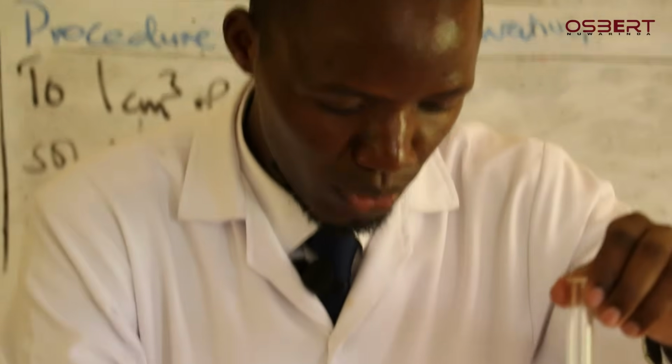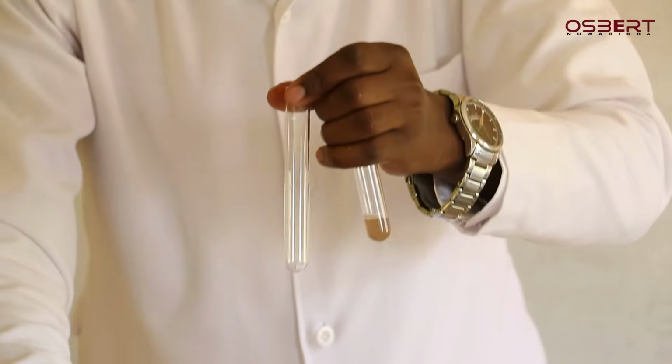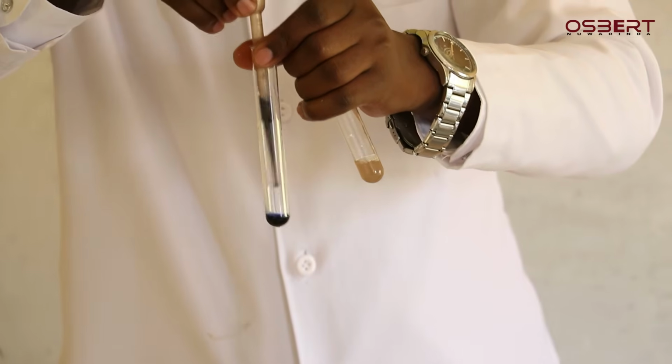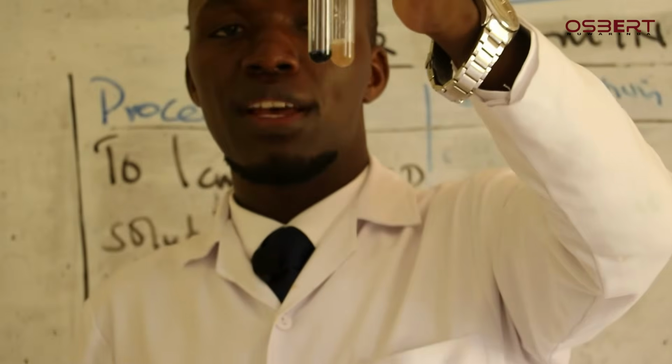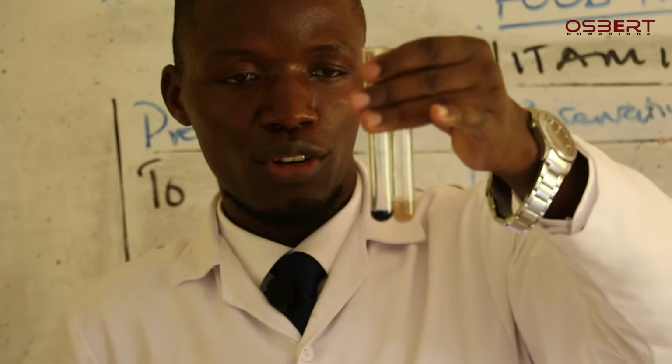Yeah, so when you check here, when you look at what we have just got here, and what we originally had in a test tube here, if I pick this original sample and put it here like this, when you see the two, you will see a very big difference. So we are saying in presence, these are around 23, 24 drops.